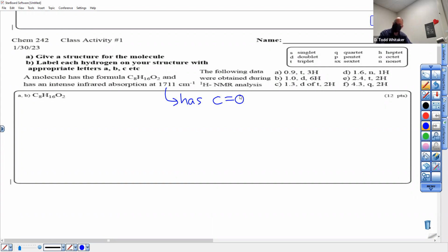I don't have any benzene information. You notice that? I look over here. If I see peaks in around 7, I get excited because that's like 6 carbons for benzene, and that's a chunk of a molecule every time. We'll have to work with what we got, right?